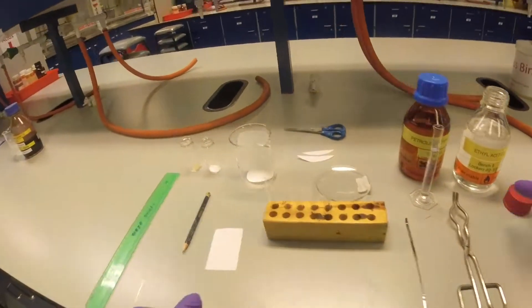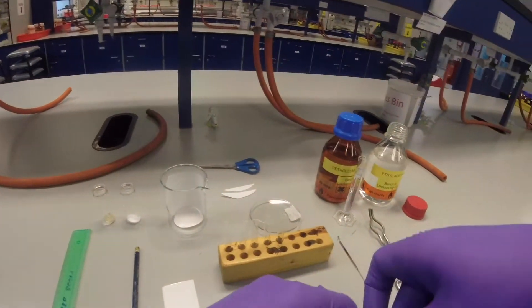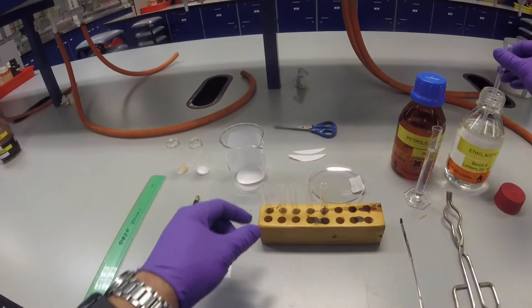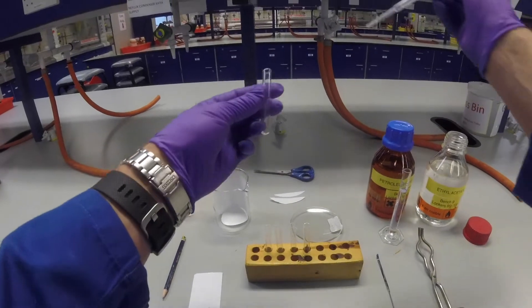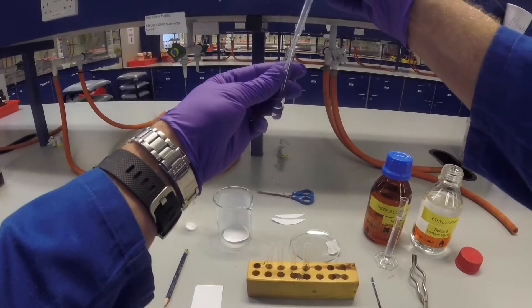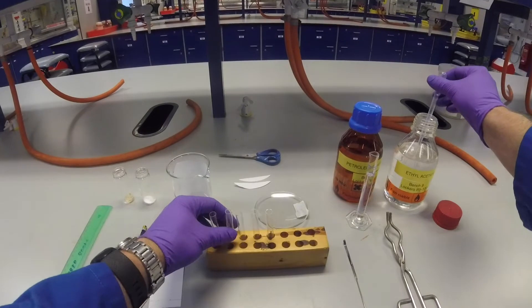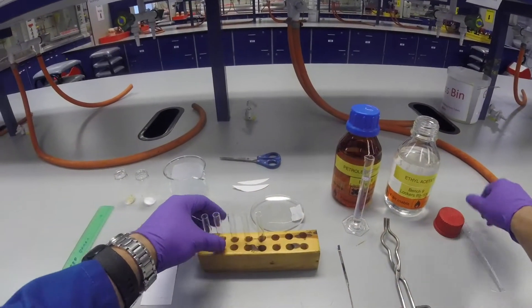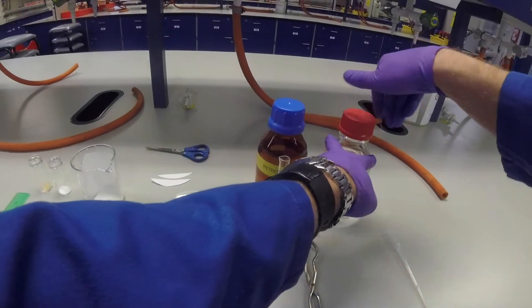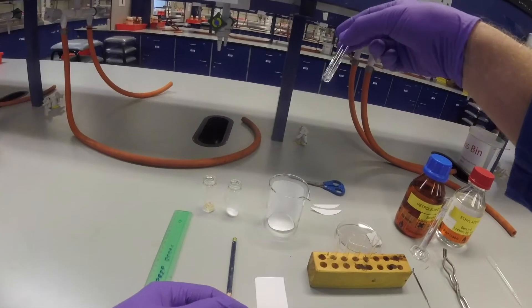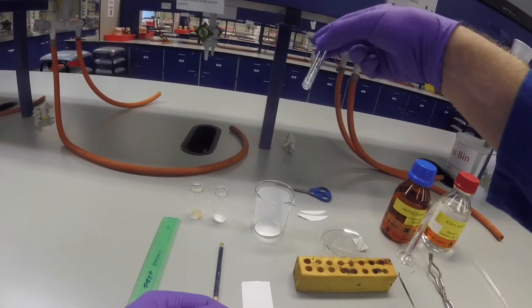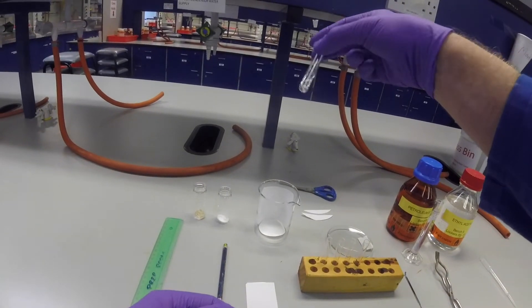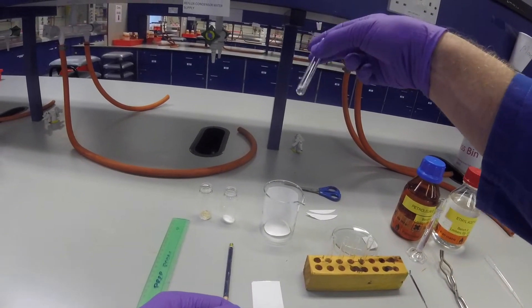We're going to take a pipette and add a little tiny bit of ethyl acetate to each of these tubes because we want to dissolve our compounds. We use about half a milliliter in each one. We use the polar solvent to make sure they dissolve. It doesn't matter if they don't completely dissolve, enough will be in solution.